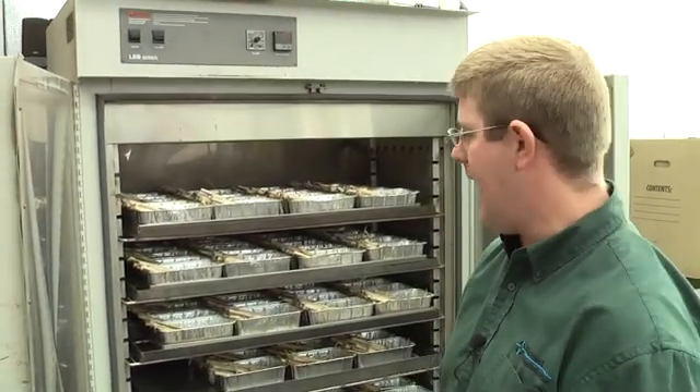These samples have been through our dryer chambers for two days and they are ready to go through our Wiley's to be ground and headed out to the lab.